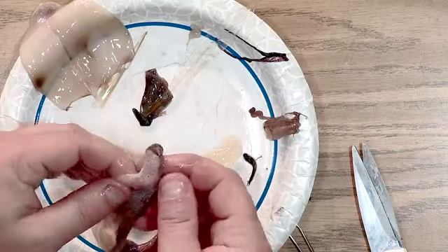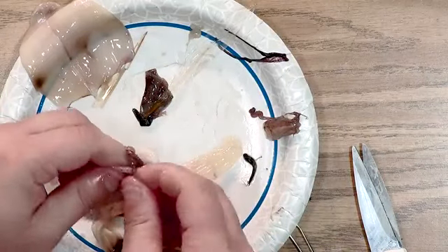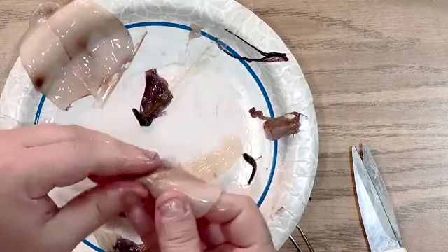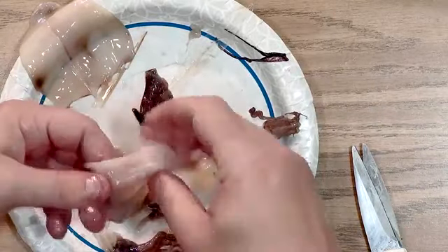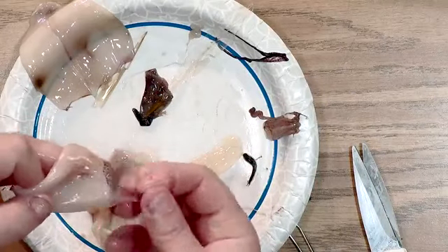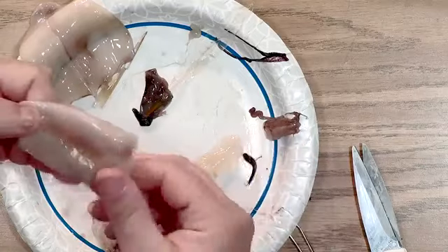So then, same thing. I can take off my fins here and my outer skin. Oh, this one doesn't want to give as much. And boom, I've got another clean mantle. Okay. Oh, it's sticking. All right.